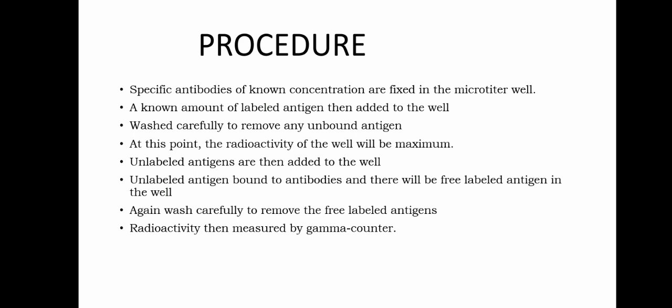Compared with the first radioactivity measurement, the second one becomes lower because of the removal of radio-labeled antigens. If the concentration of radio-labeled antigens in the well is higher, the radioactivity becomes high, and if the concentration of unlabeled antigen is higher, the radioactivity becomes lower.